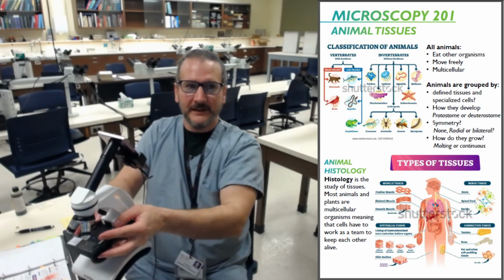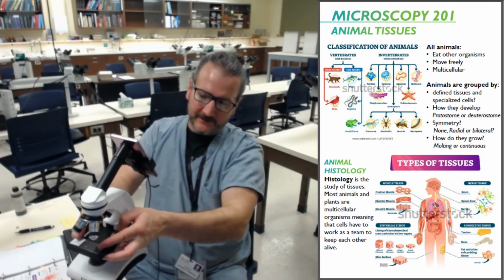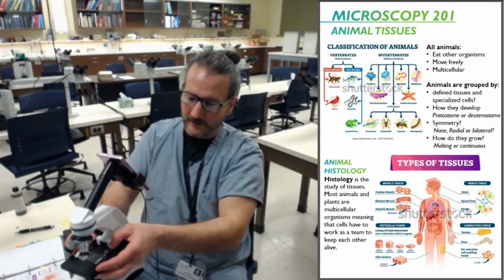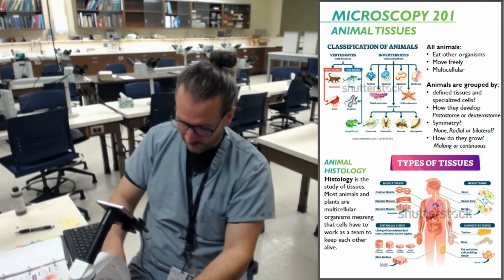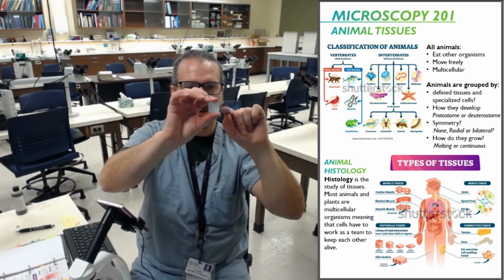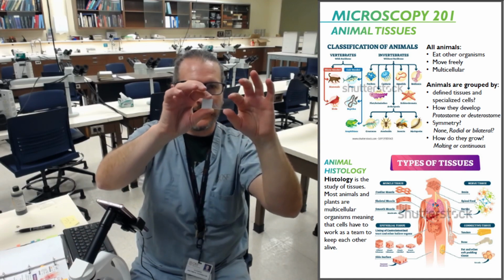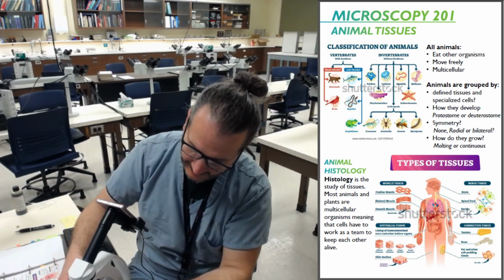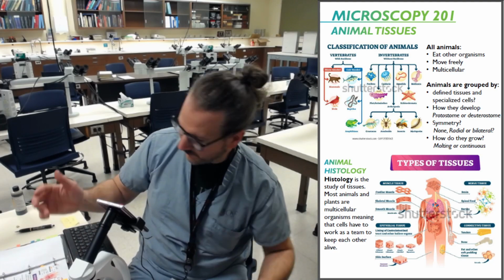Scanning. I'm going to take my thumbs, put my thumbs down on the stage clips, holding them up. I guess I can lift this up a little bit. Stage clips, holding it up. And I'm going to take my slide and pull it back. Put it into place. I have my number 1 light on, which is my underlighting. And if you didn't see it with the naked eye, right in the middle, you have a little reddish pink patch. That's what your target is. So we're going to get that reddish pink patch right over our light source, so it glows. Looks like I'm all set.